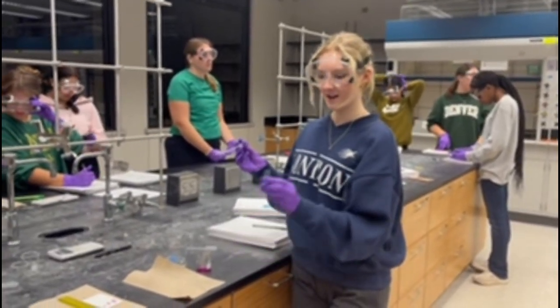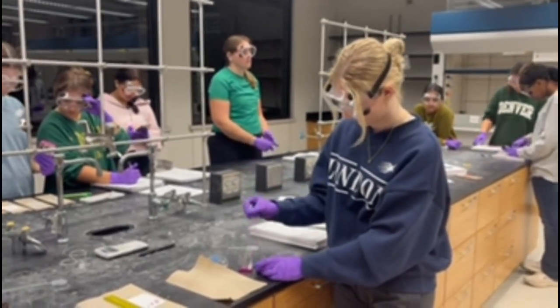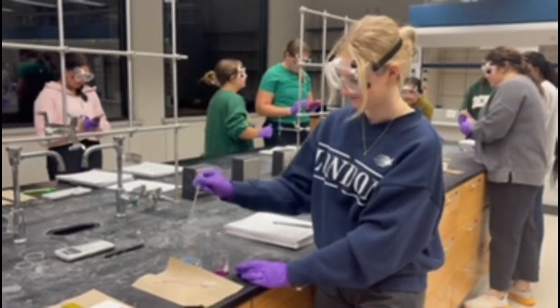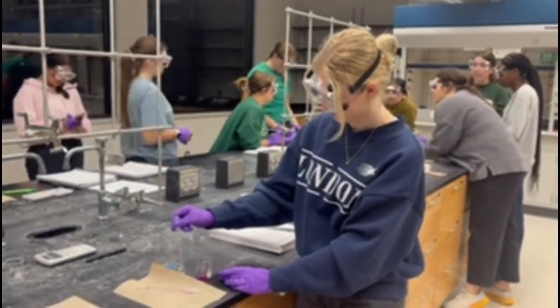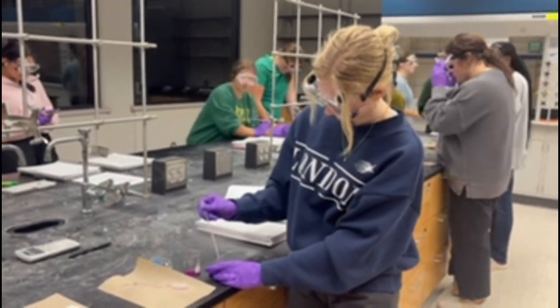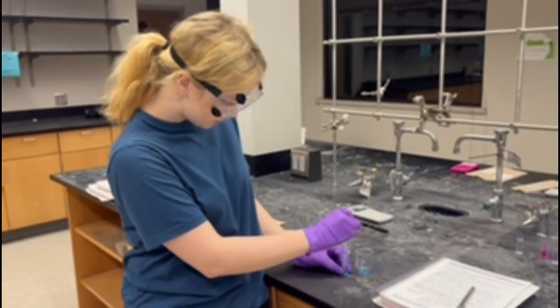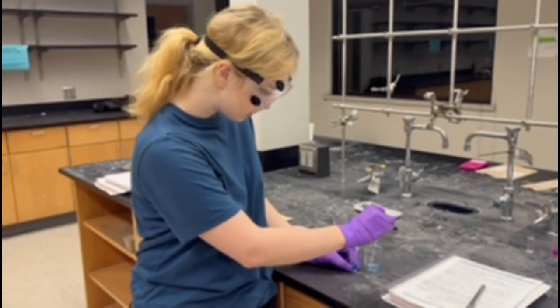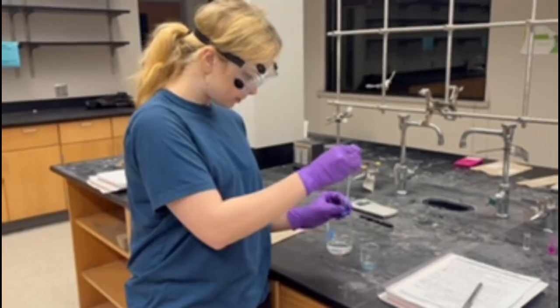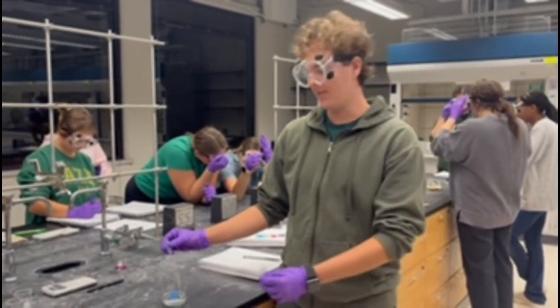Okay, we're going to prepare our first cuvette with the dye we extract. Now we're going to dilute it with water, a solvent. We're going to make the blank with the solvent.